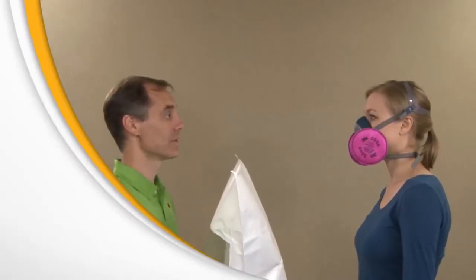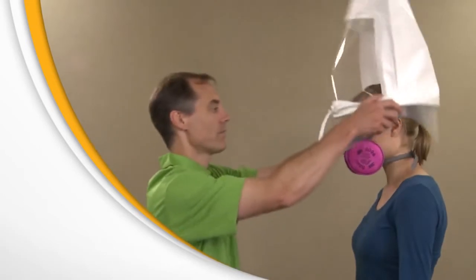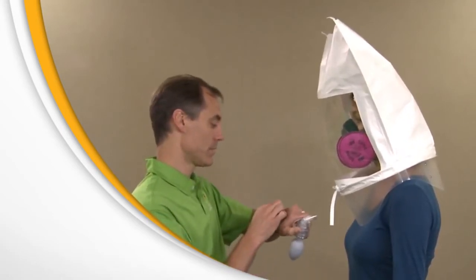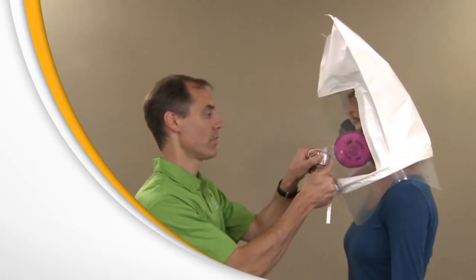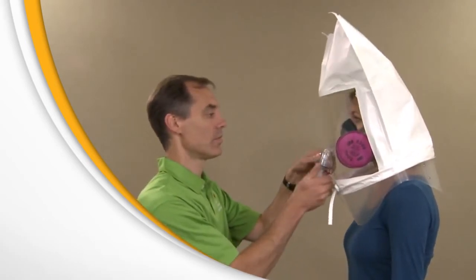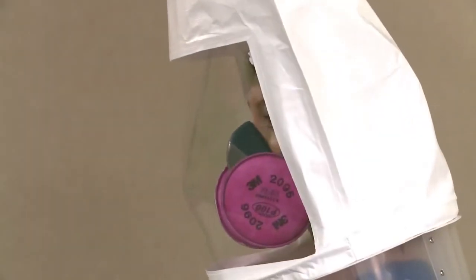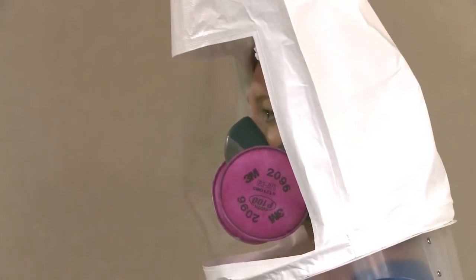The instructor will place the test hood over your head again and position it so you have about 6 inches between your face and the window. Now, using nebulizer number 2, the instructor will spray the fit test agent into the hood, using 10, 20, or 30 squeezes, depending on the number of squeezes needed to taste the test agent. To maintain the concentration of solution during the test, the instructor will inject one half the number of squeezes used at the beginning of the fit test, 5, 10, or 15, every 30 seconds thereafter. Continue to breathe through your mouth during the entire test.